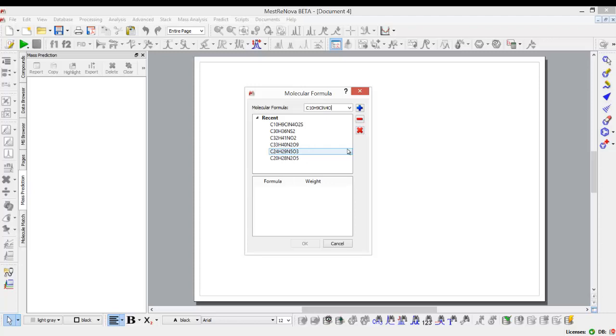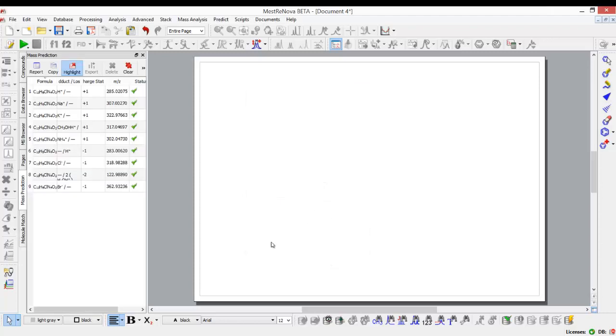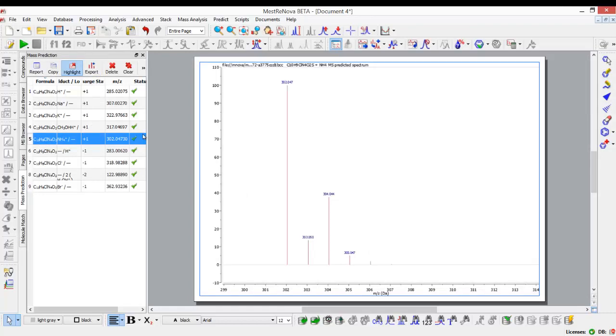I can then very quickly get my prediction. So I select it, I add it to what I want to predict, and I can immediately take a look at what the isotope cluster would look like for my formula.